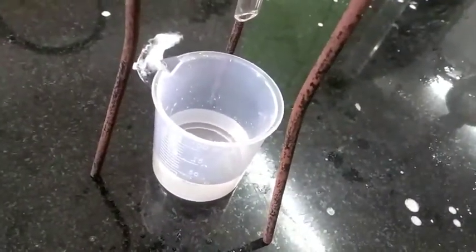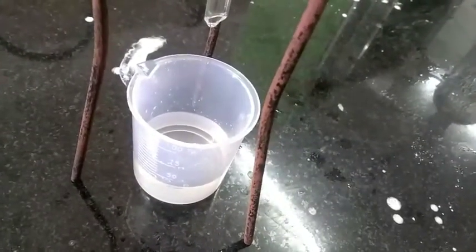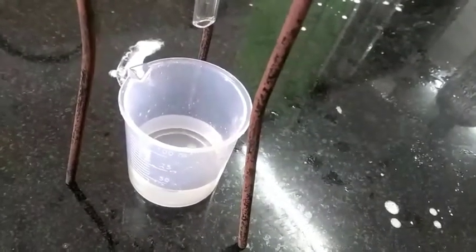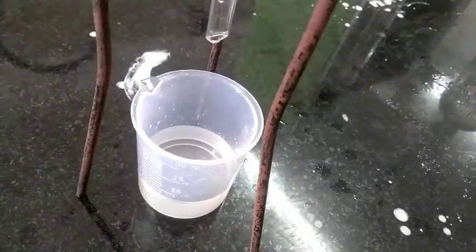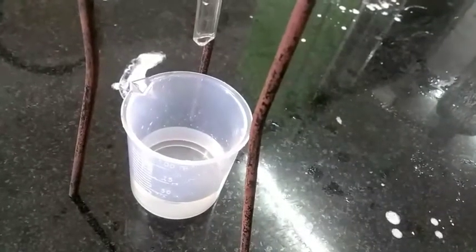The category of this is flavoring agent. Dose is 0.25 to 1.0 ml and it will be stored in a well closed container, and uses will be as a flavoring agent and as a carminative.